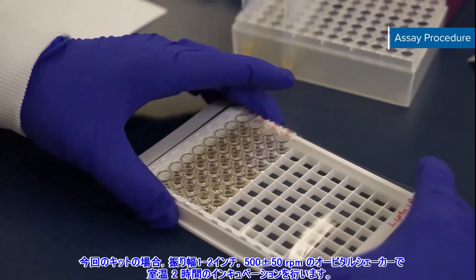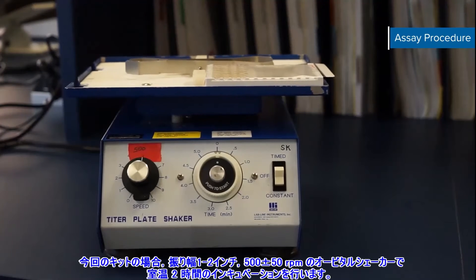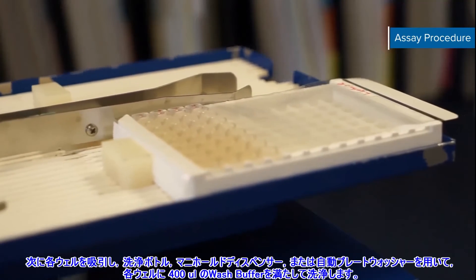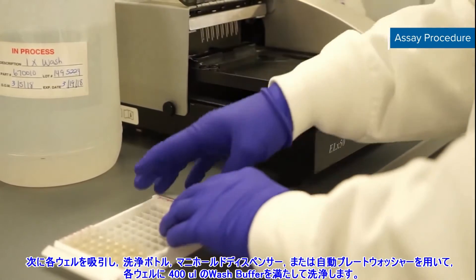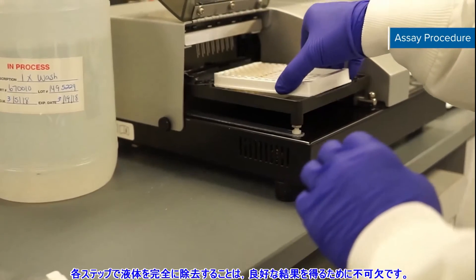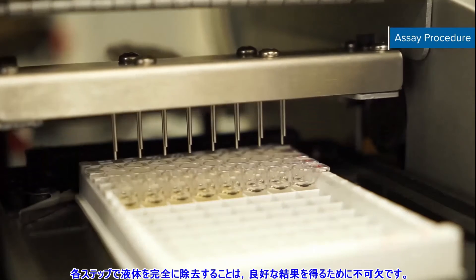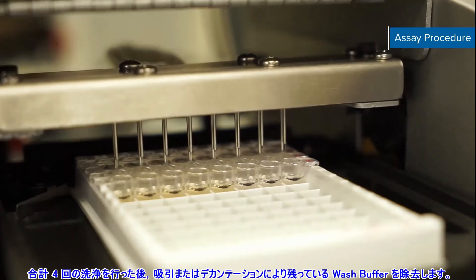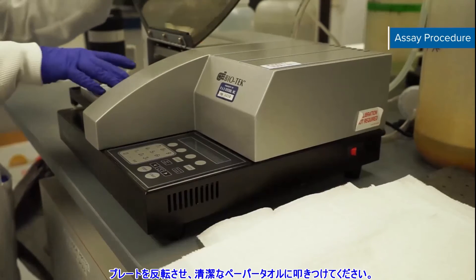For this kit, incubate the plate for two hours at room temperature on the shaker at a 0.12 inch orbit at 500 plus or minus 50 rpm. Next, aspirate each well and wash by filling each well with 400 microliters of wash buffer using a squirt bottle, manifold dispenser, or auto washer. Complete removal of liquid at each step is essential to good performance. Wash for a total of four washes and after the last wash, remove any remaining wash buffer by aspirating or decanting. Invert the plate and blot it against clean paper towels.